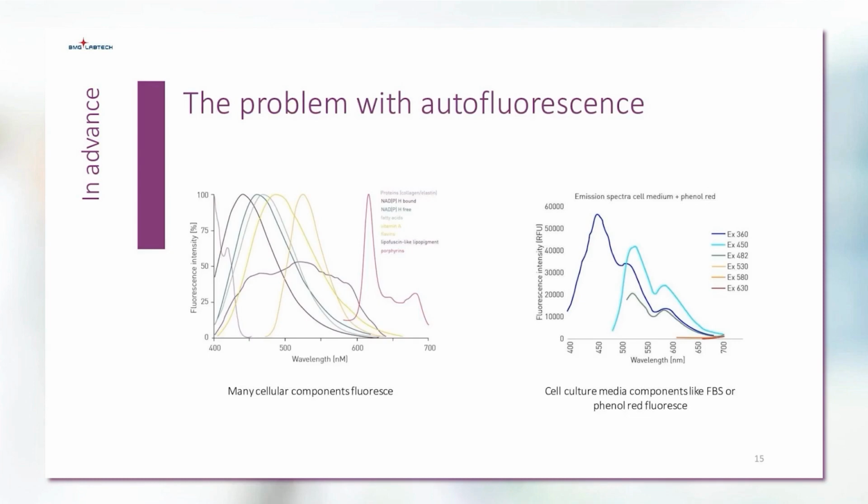While in many cases it is sufficient to select wavelengths and bandwidths based on a signal molecule, some assay systems with high background signals may need further adjustments. One such example that specifically impacts fluorescence measurements is autofluorescence. Autofluorescence is caused by fluorescent assay components, usually in the green to blue spectral range, that interfere with the actual fluorescent measurement. This often occurs in cell-based measurements as many cellular as well as cell culture media components fluoresce.